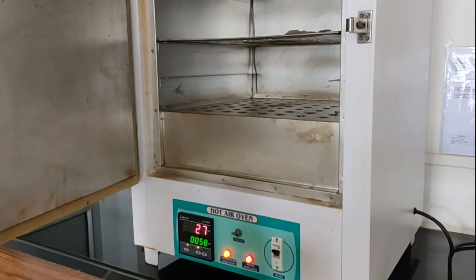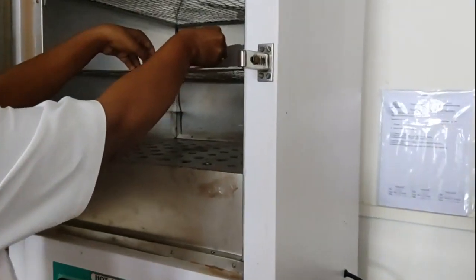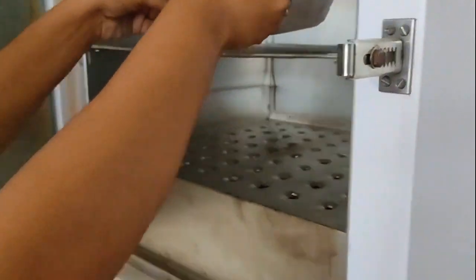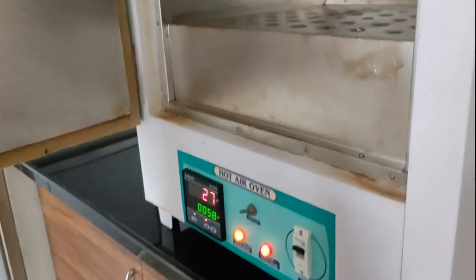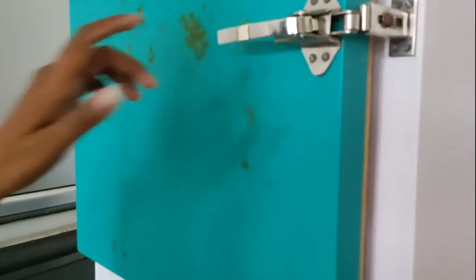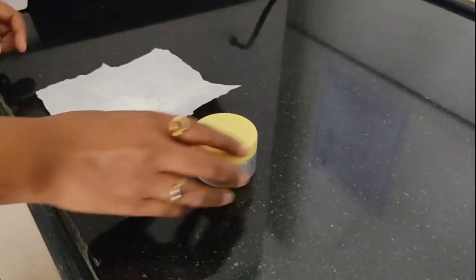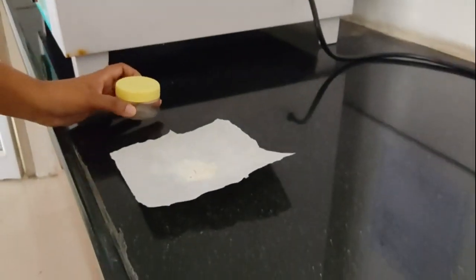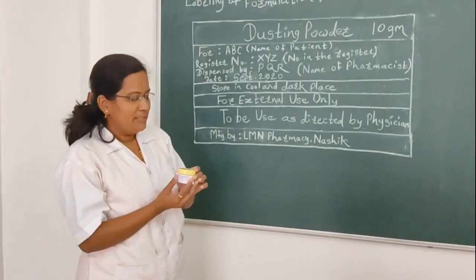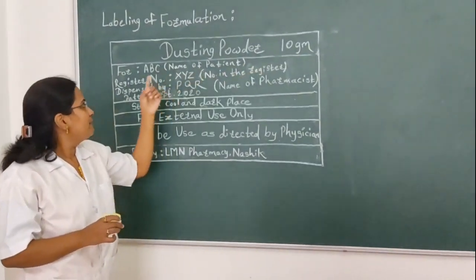We will proceed to sterilize this powder in the oven at 160 degrees Celsius. We have the hot air oven ready. I am going to place this powder into the hot air oven for 1 hour for sterilization at 160 degrees Celsius. After 1 hour the powder is completely sterilized. I am going to transfer this sterile powder into the container.